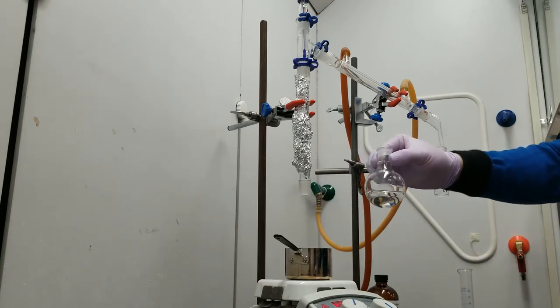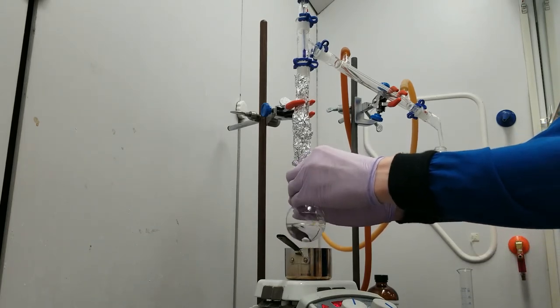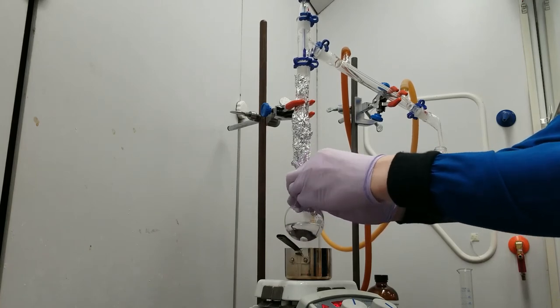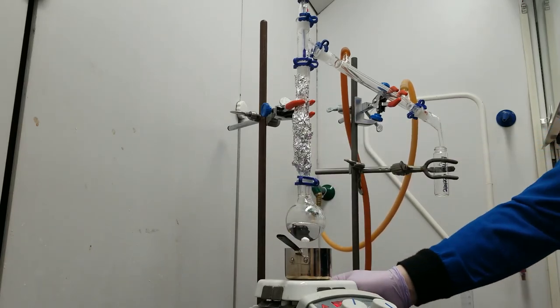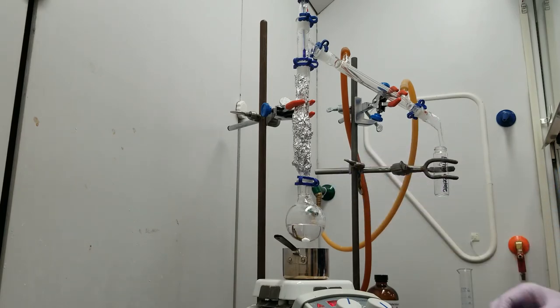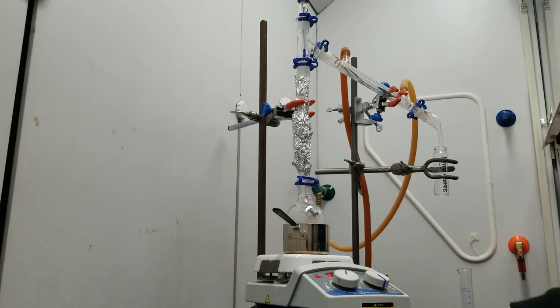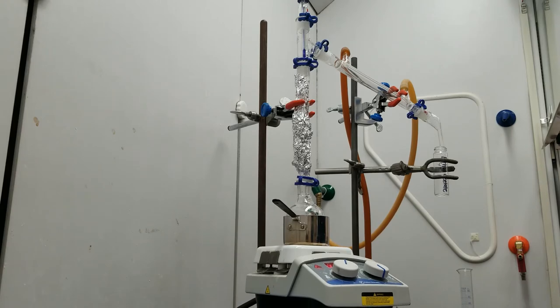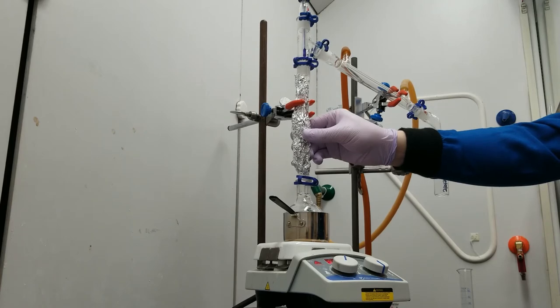Go ahead and got a clamp right here. One trick when you're building a massive apparatus like this is to hang your round bottom flask or your reaction flask above the heat source, get the heat source hot, and then bring the heat up to your reaction flask. Because if I had to drop this whole thing down to meet the heat, that'd be way harder. So I'm gonna just wiggle this a little bit, make sure I can feel it contacting that sand in there.